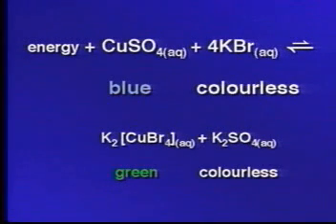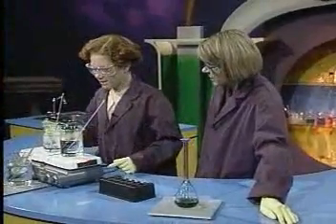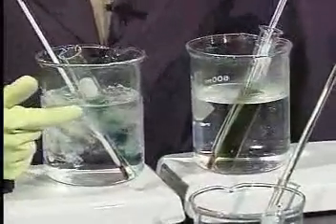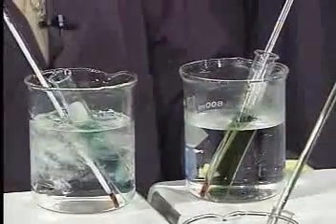All right. Now, from this information on this reaction at equilibrium, can you now make some observations and some conclusions? Okay, well, I can tell by looking at these that they're different colors, so they each must contain different amounts of the colored ions. The one in the cool water bath is a bit more blue, so it must have more copper(II) sulfate in it than the green copper bromide complex.